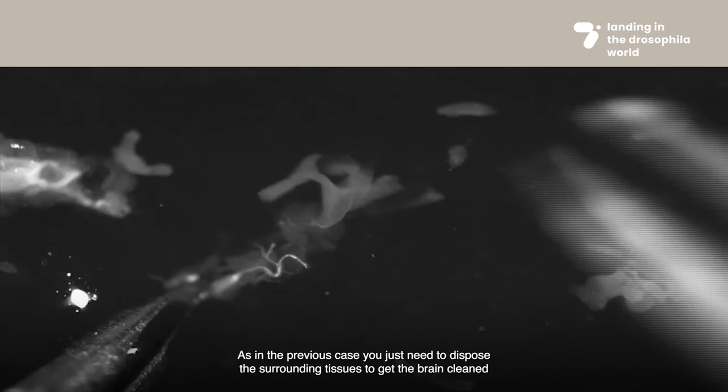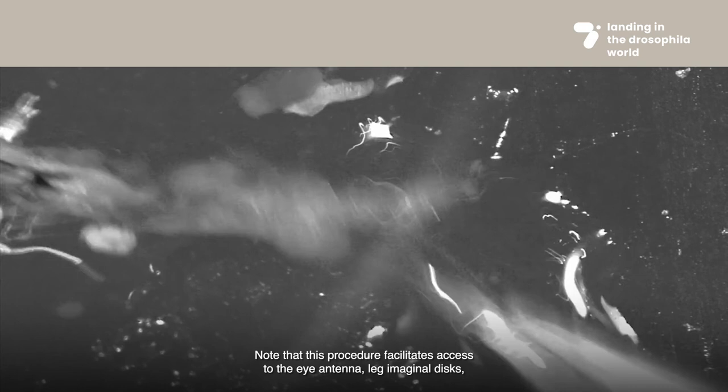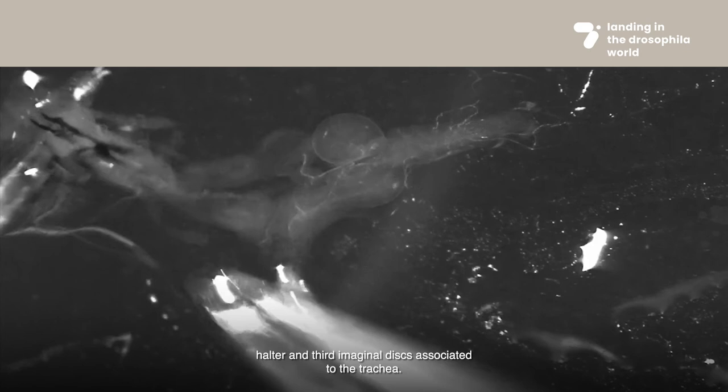As in the previous case, you just need to dispose of the surrounding tissues to get the brain cleaned. Note that this procedure facilitates access to the eye, antenna, and leg imaginal discs and brain associated with the ventral cord, but would not be ideal for the dissection of the wing, halter, and third imaginal discs associated with the trachea.